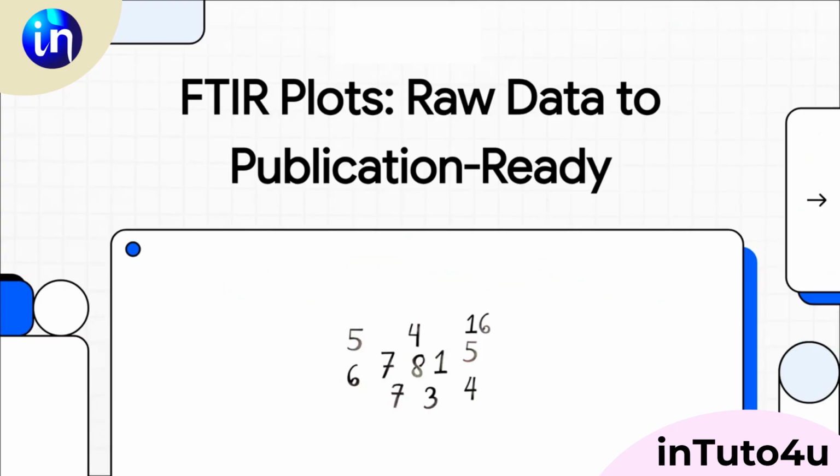Hey there, and welcome to The Explainer. So if you're a researcher, you totally know this feeling. You've got this raw, kind of messy FTIR data file, and you need to somehow transform it into a clean, professional-looking graph for a paper or a presentation. Well, today, we're going to show you exactly how to do that.